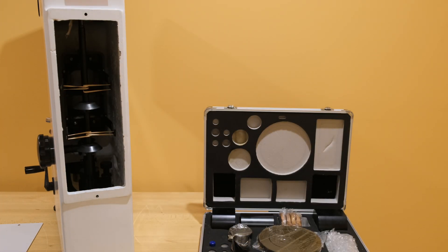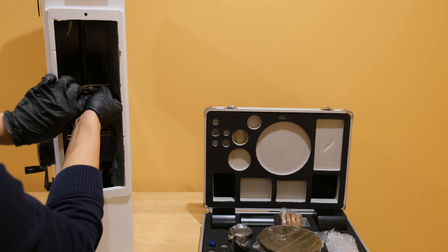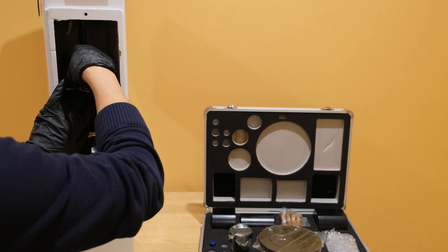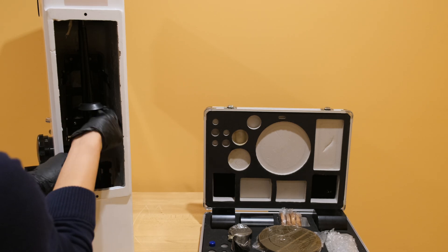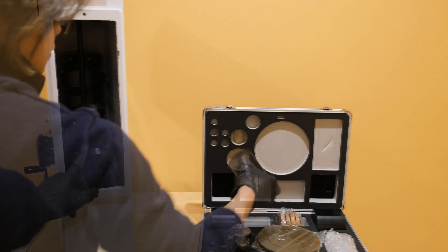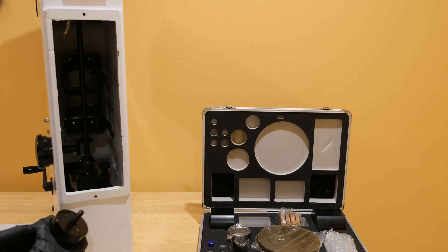For deadweight machines, a set of weights must be placed in order for the test to run properly. Open the access panel at the rear of the machine and remove the rubber bands holding the weight holder in place. Install the weights onto the rod, making sure they are installed in the correct order.